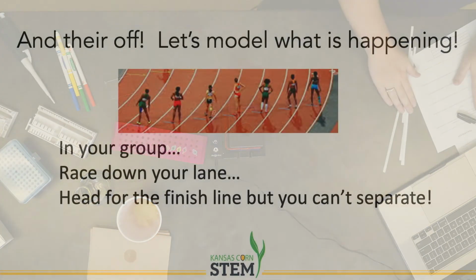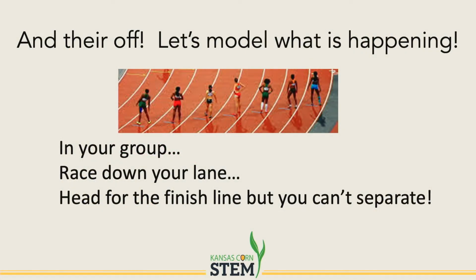Now that we need to wait about 20 minutes for this DNA to do its work, we need to talk about what's actually happening here. Well, really we have a DNA race. Remember, we cut up all of that DNA into tiny pieces. Some are bigger, some are smaller. I like to talk about this as it's a race.